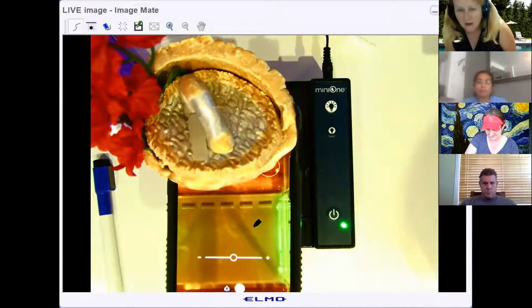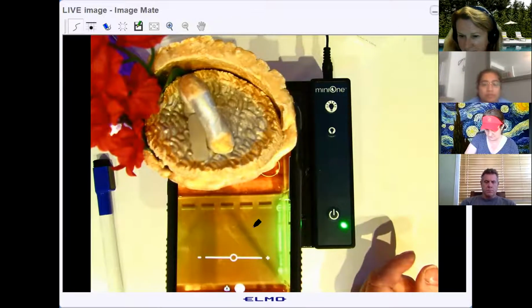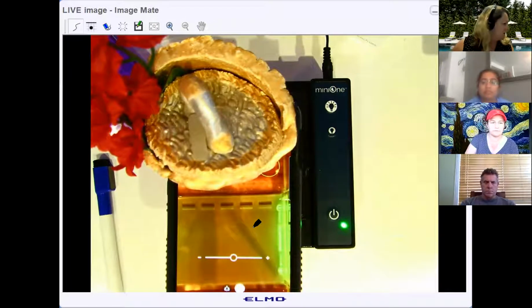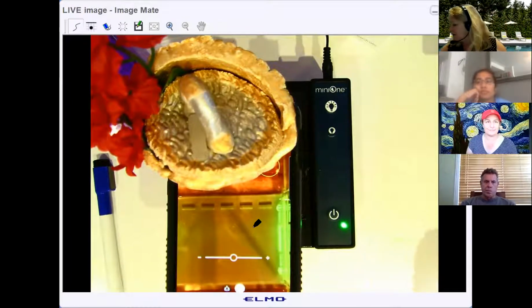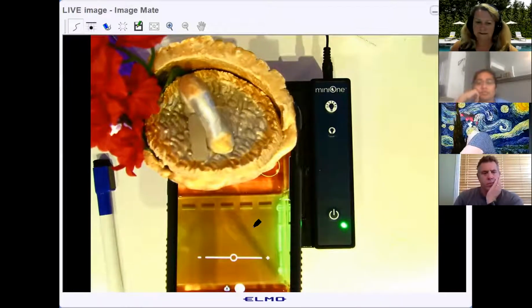Okay. All right, can you guys see how the DNA is already entering the gel and running through there? It goes really super fast. Now, I know there's a couple of you in the group who teach biotech electives. Do you have any recommendations or anything you want to add about equipment to use for gel electrophoresis?